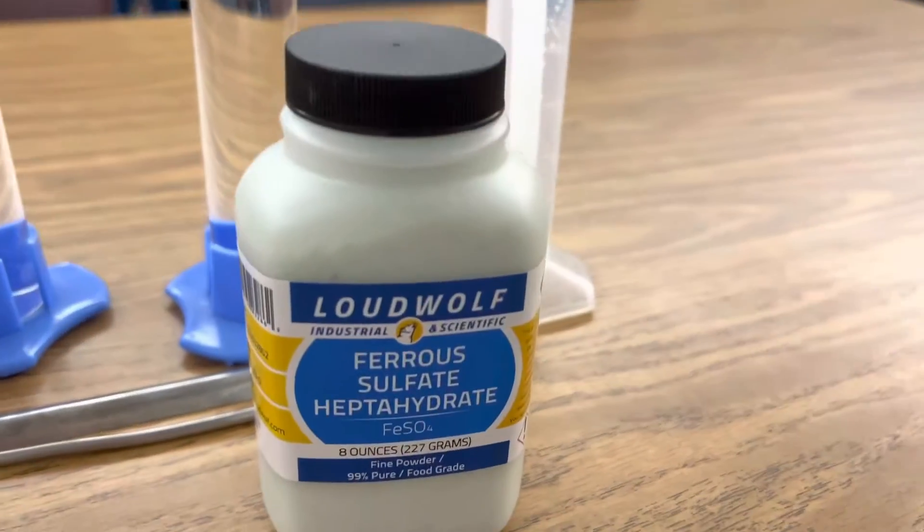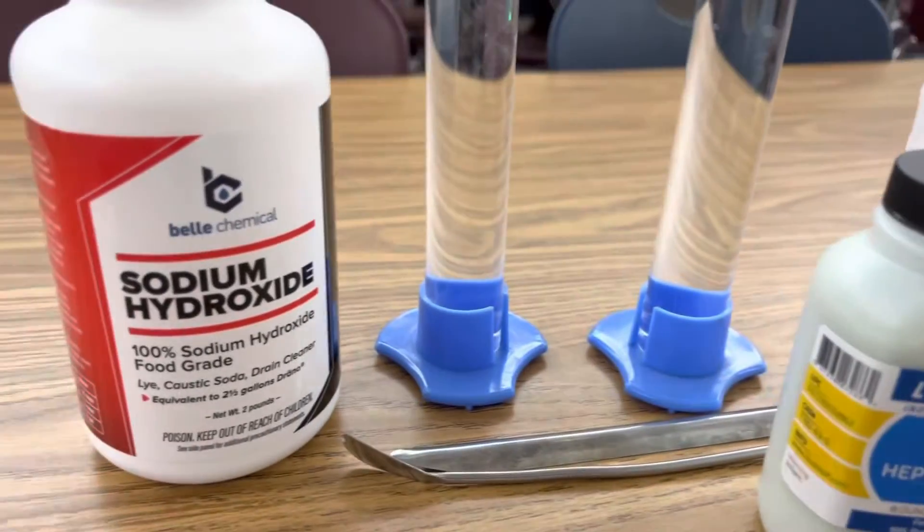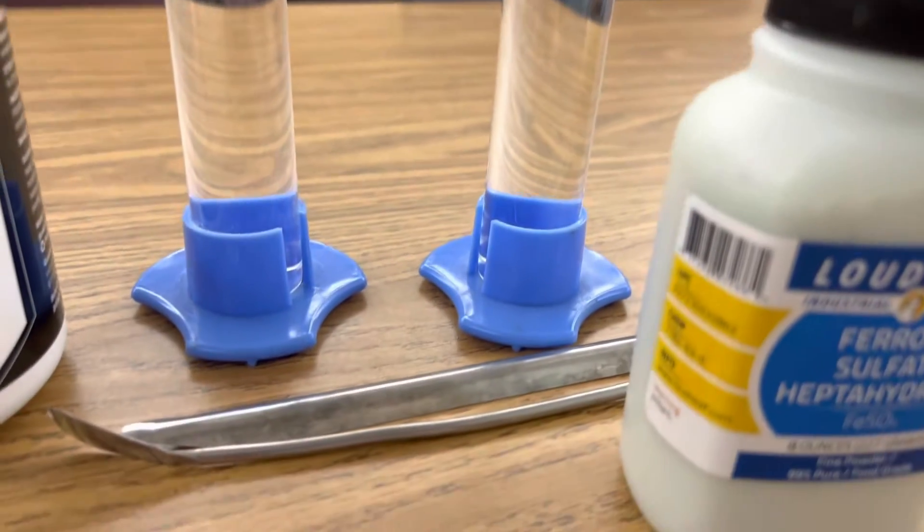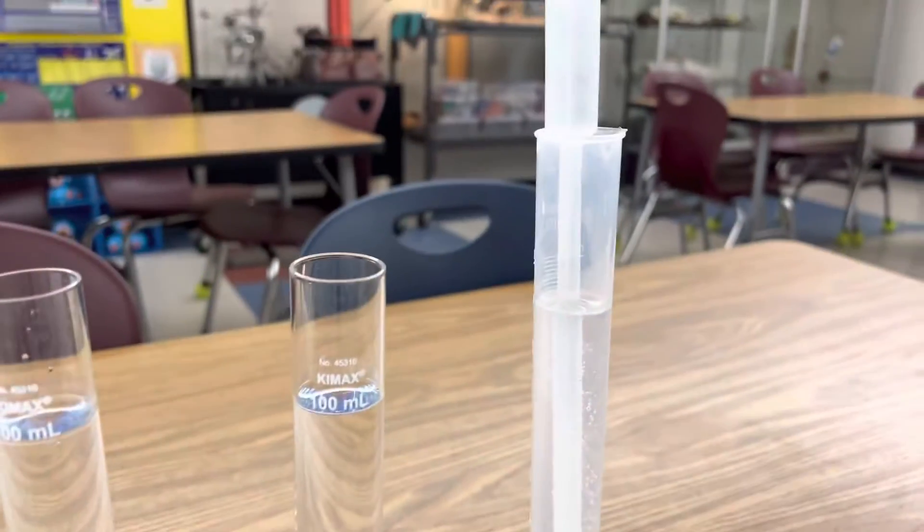All I'm using in this investigation is ferrous sulfate, sodium hydroxide, two graduated cylinders with 100 milliliters of distilled water, my stir spoon, and a dropper.